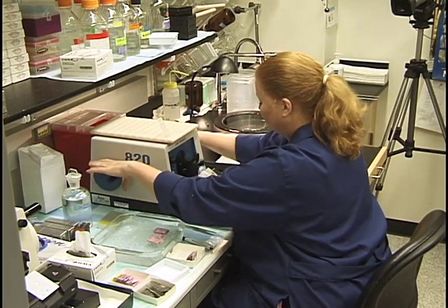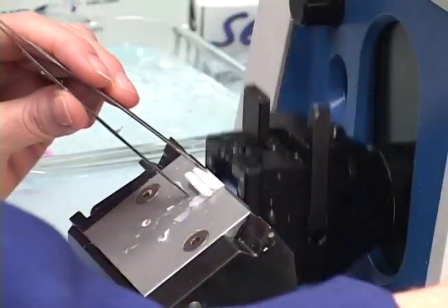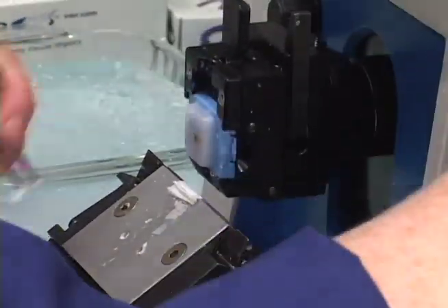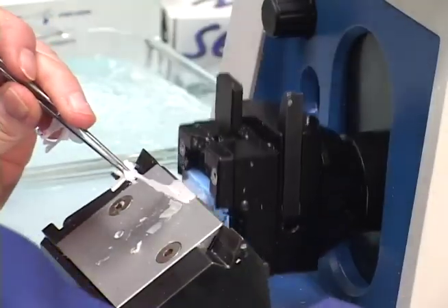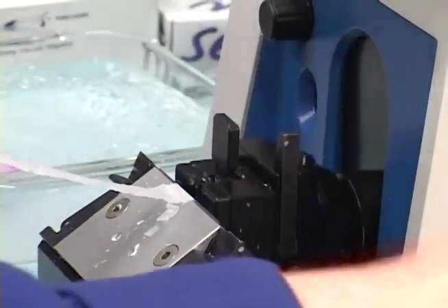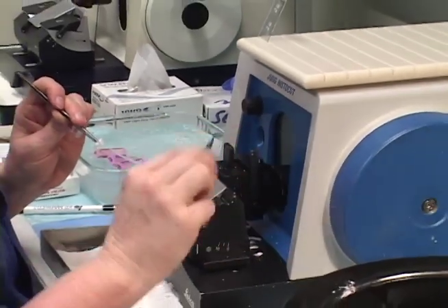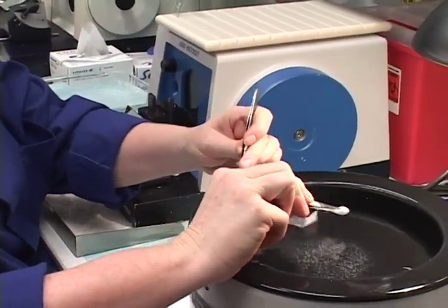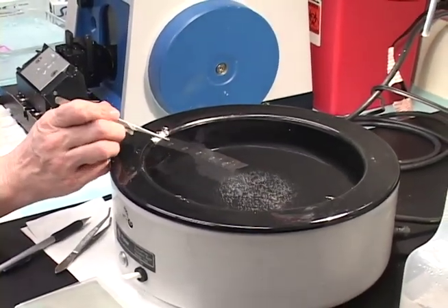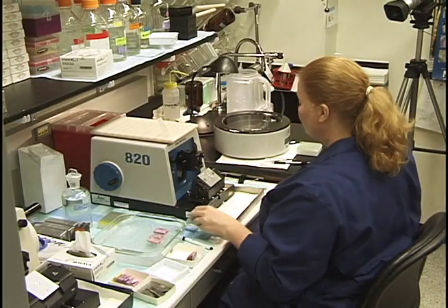The microtome is now ribboning beautifully — took a while but it's very even, a beautiful ribbon with that block method. You can use forceps dipped in water to grip and bring the ribbon over and lay it down. Very smooth, very nice ribbon, although the tissue is a bit dry so I would soak that block longer obviously.